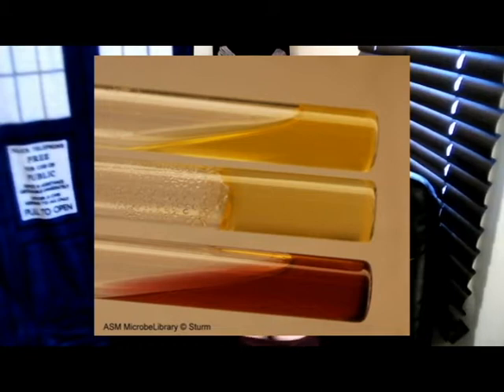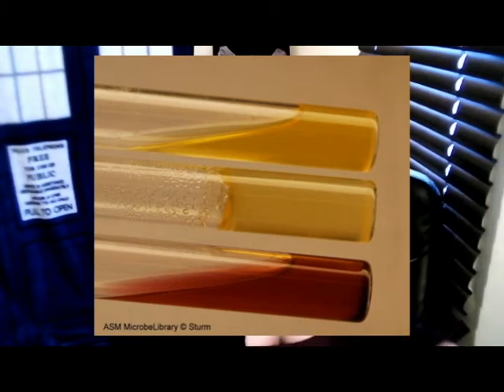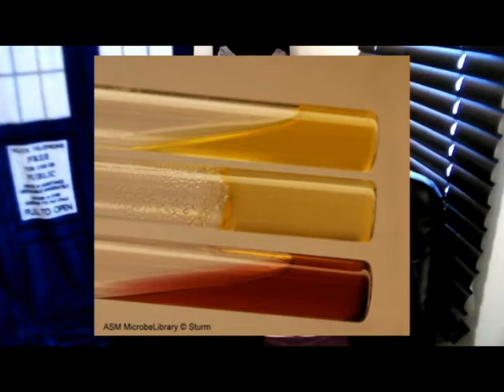And if they changed color to yellow, it means that the saccharides were fermented, so they were used up by the bacteria. In lab 4, you used gelatin, and understanding why certain bacteria were able to hydrolyze the gelatin and why others weren't is important. So if a gelatin became liquid, is that a positive or is that a negative test? Hint, if it's gelatinous, like a gummy bear is gelatinous, and it becomes liquid, that would be an indication of a positive test. If it remained gelatinous, that's a negative test.